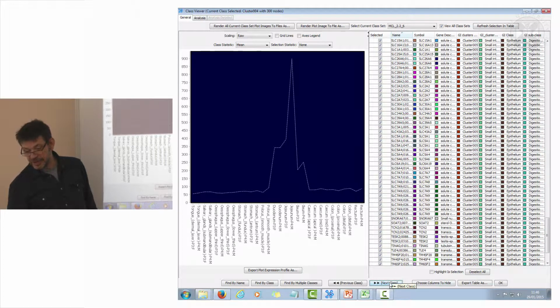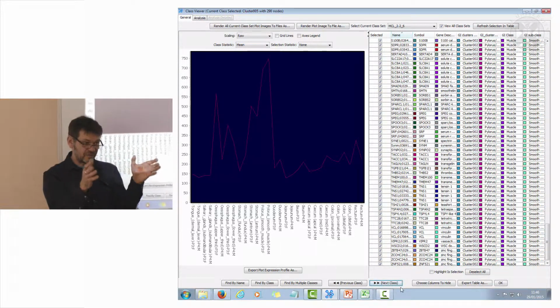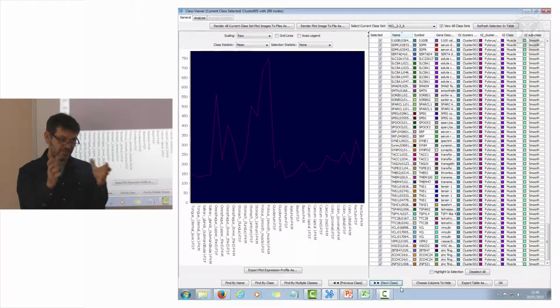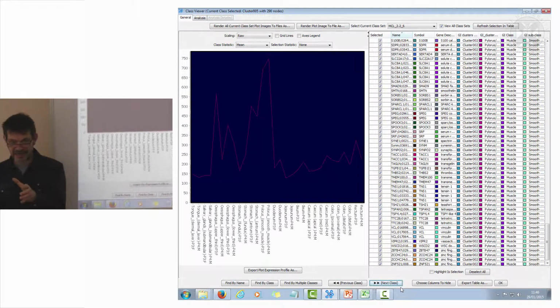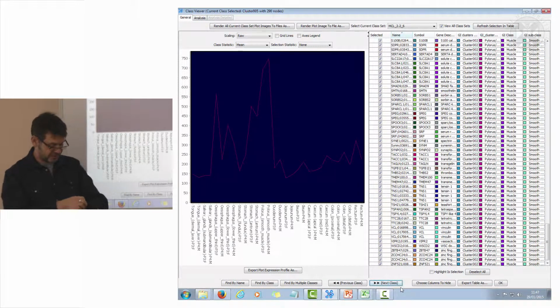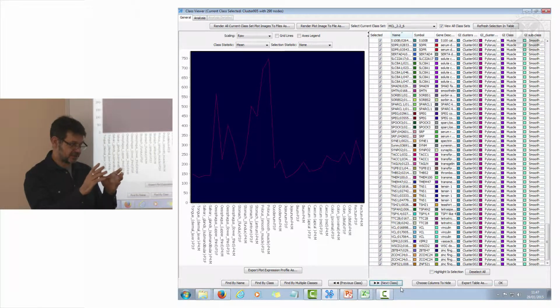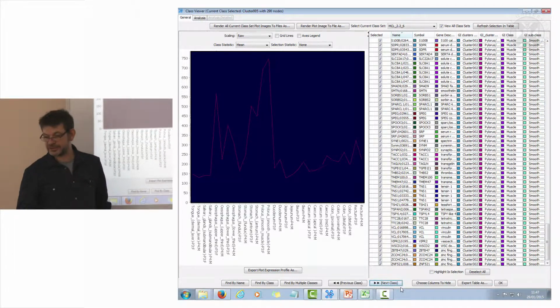And so what you have to do with this data is, first of all, you get the clustering, and then it's worth sitting down and working out what you think any given cluster is. If you're doing this kind of relatively complex biology, the only way you can do that is to begin to take it out and do it. So in the last few minutes that we've got, I want to show you how you export things, how you begin to take this data from a nice view to understanding it to doing something else with it.